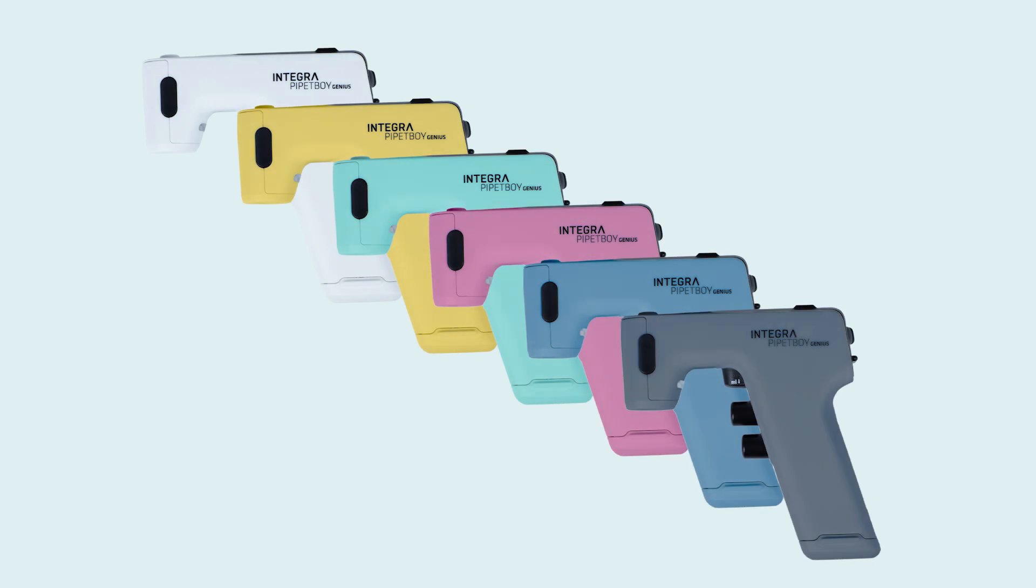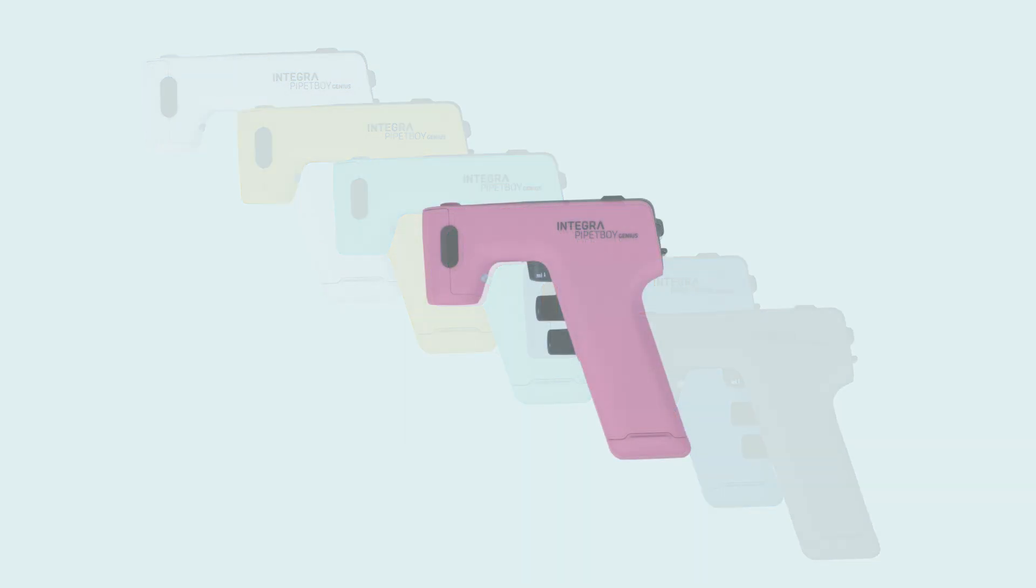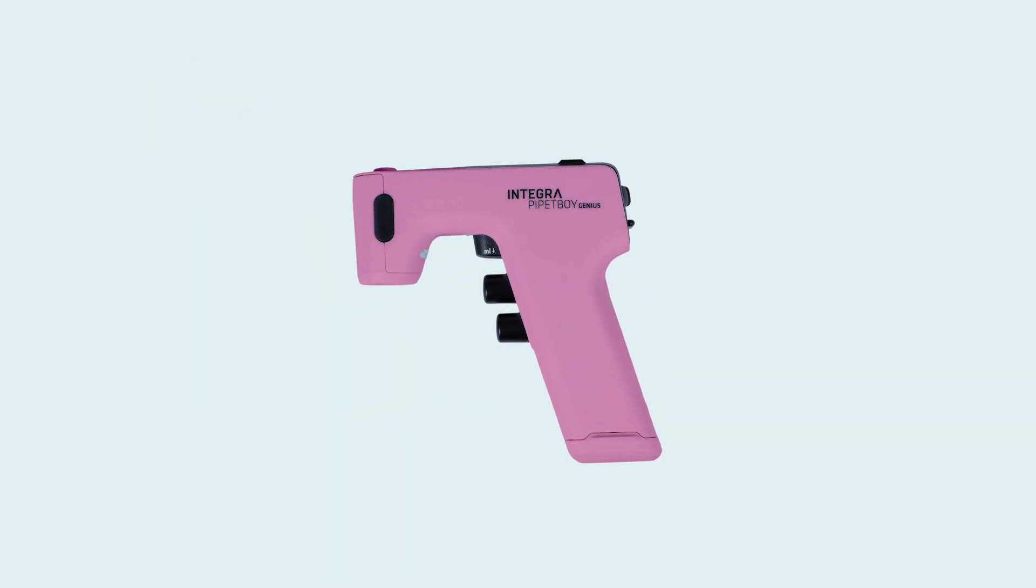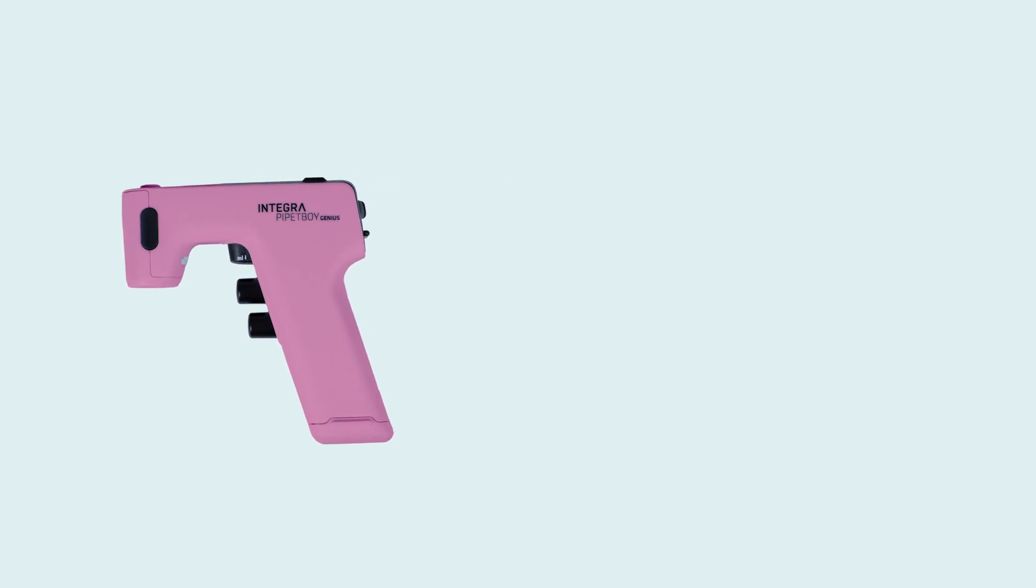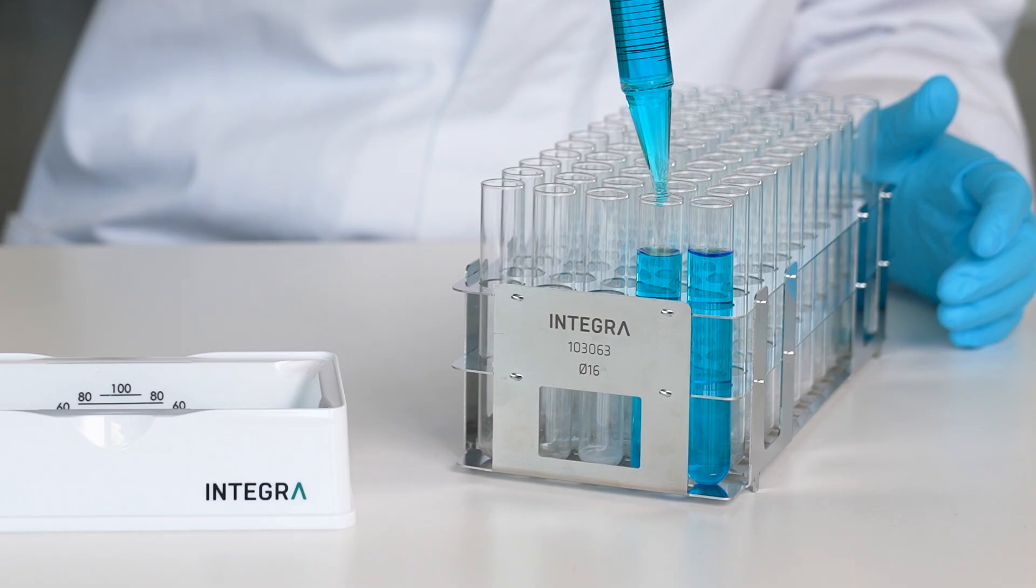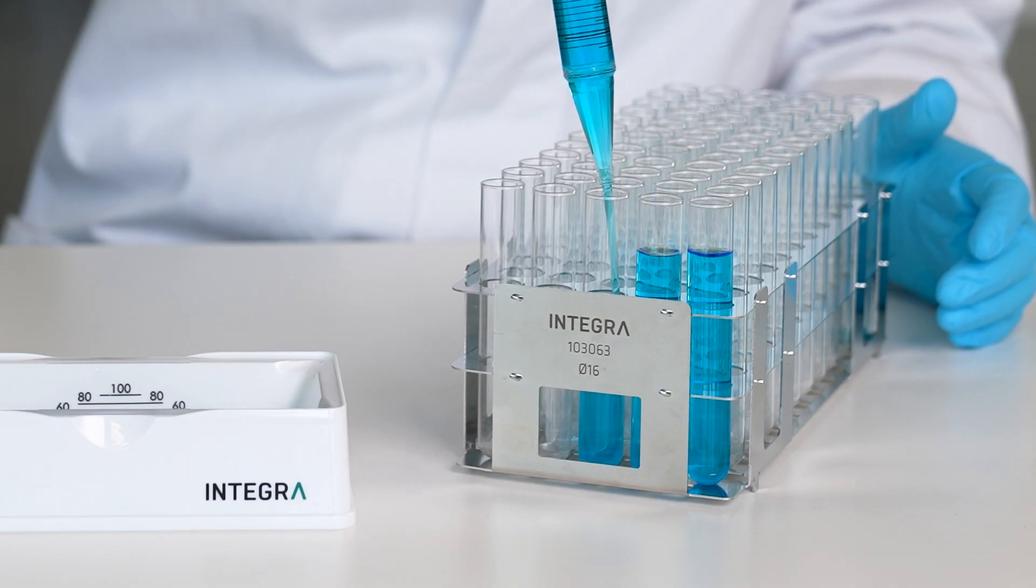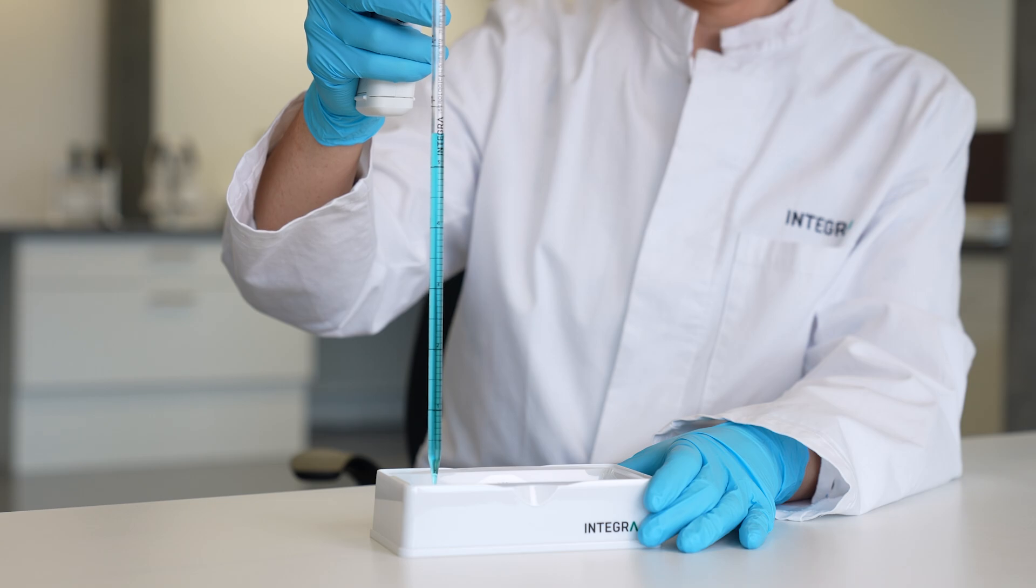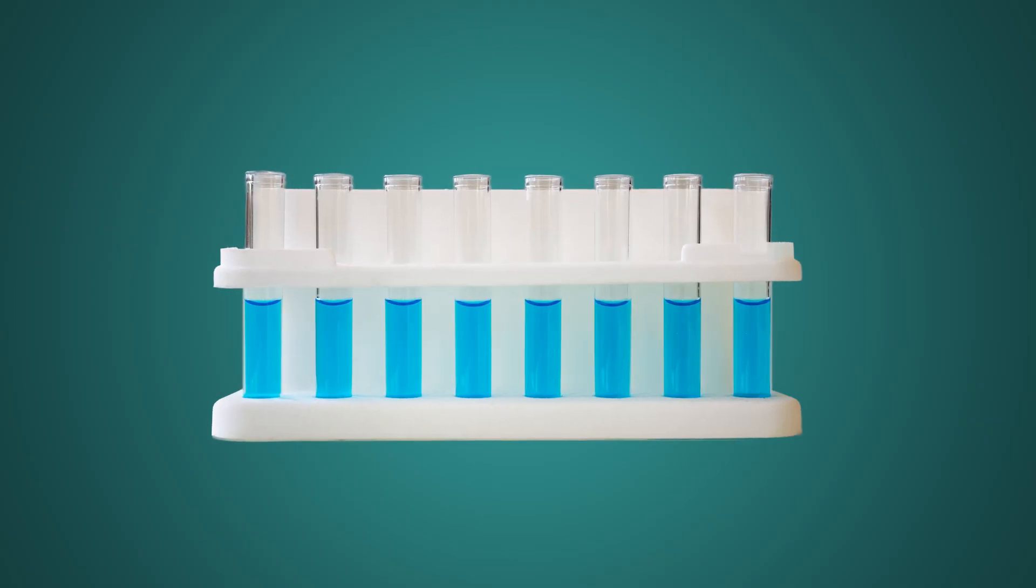The Pipette Boy Genius pipette controller from Integra will revolutionize what you think about serological pipetting. In this video, we'll talk you through everything you need to know to get the most out of your Pipette Boy Genius, including how to operate the repeat dispense mode, how the overfill protection works, and how the aliquots are even more precise than what you're seeing on your pipette's graduations.